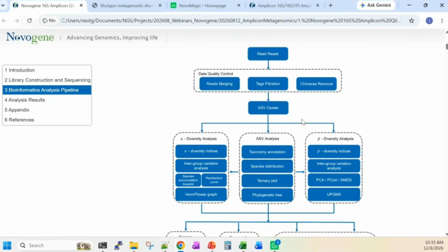That's why we mostly use ASVs now, because ASV tries to exclude the sequences that likely come from sequencing errors, and then whatever is remaining, we see how many different sequence clusters or sequence variants there are. So we no longer use the 97% cutoff to group the samples.